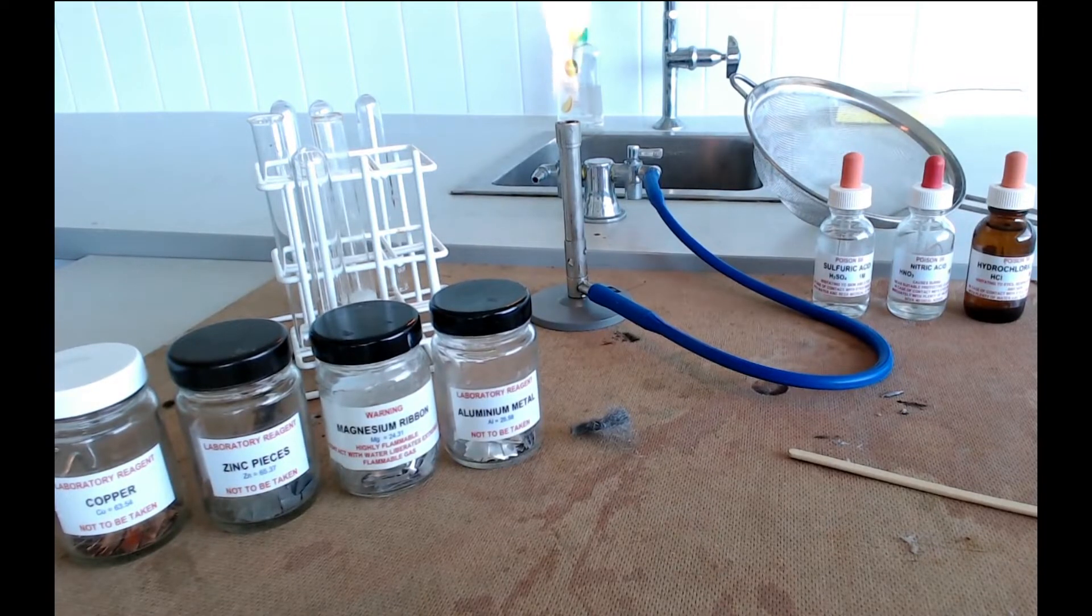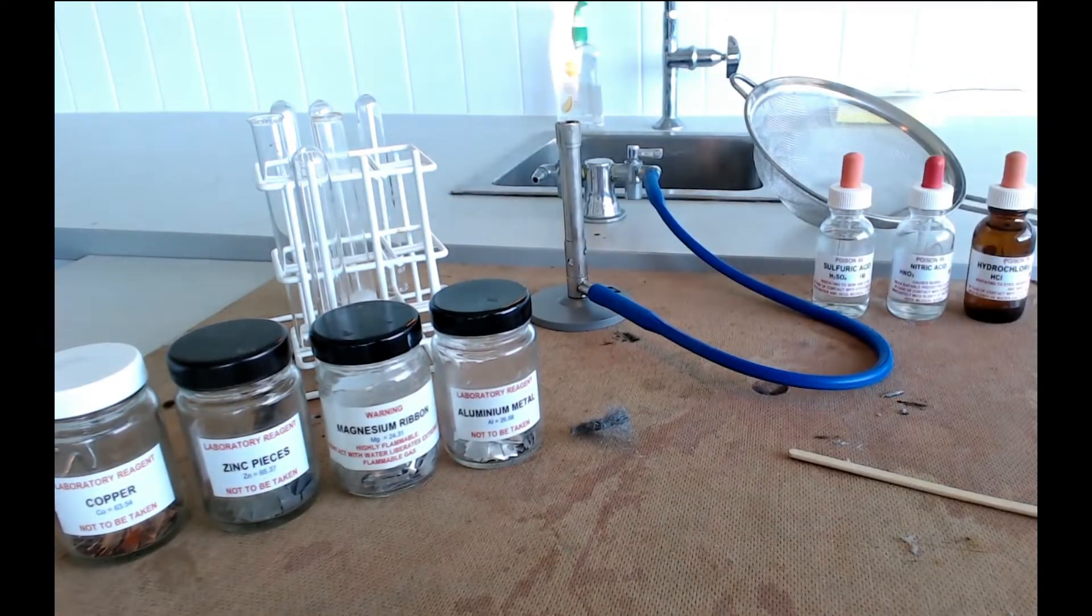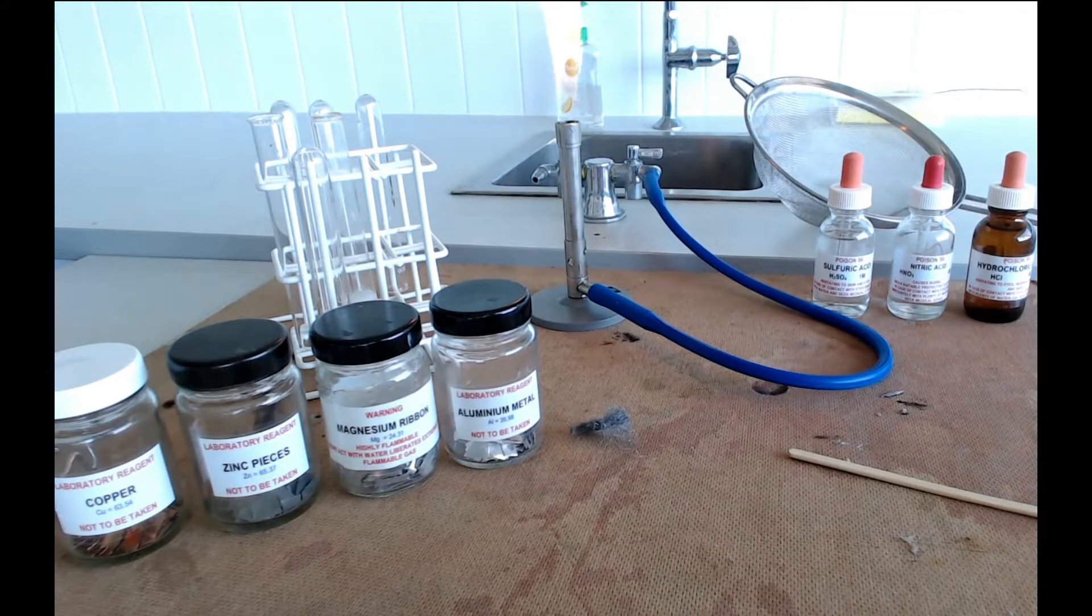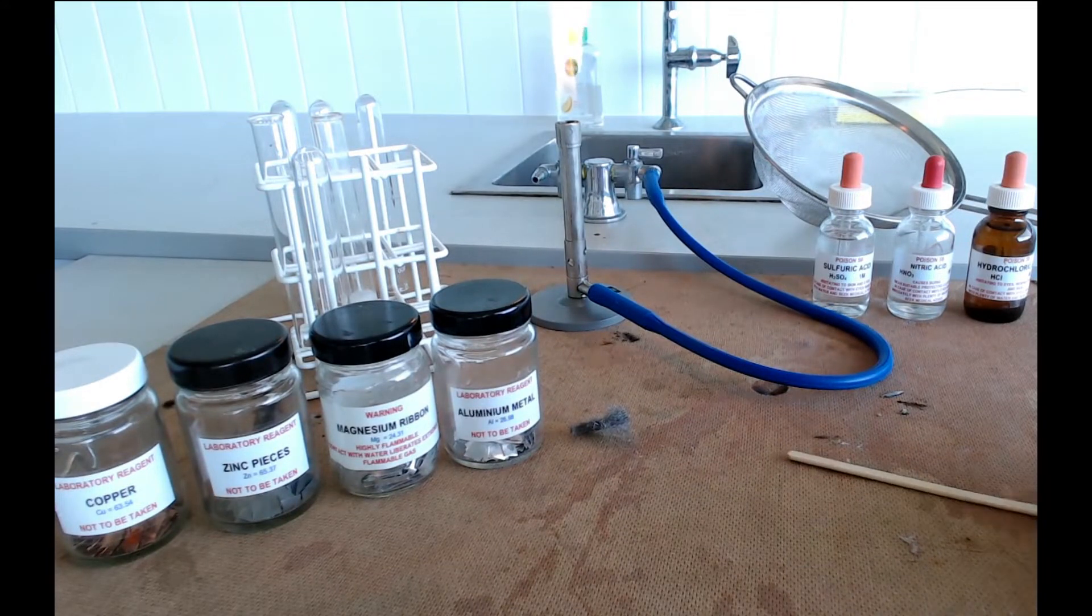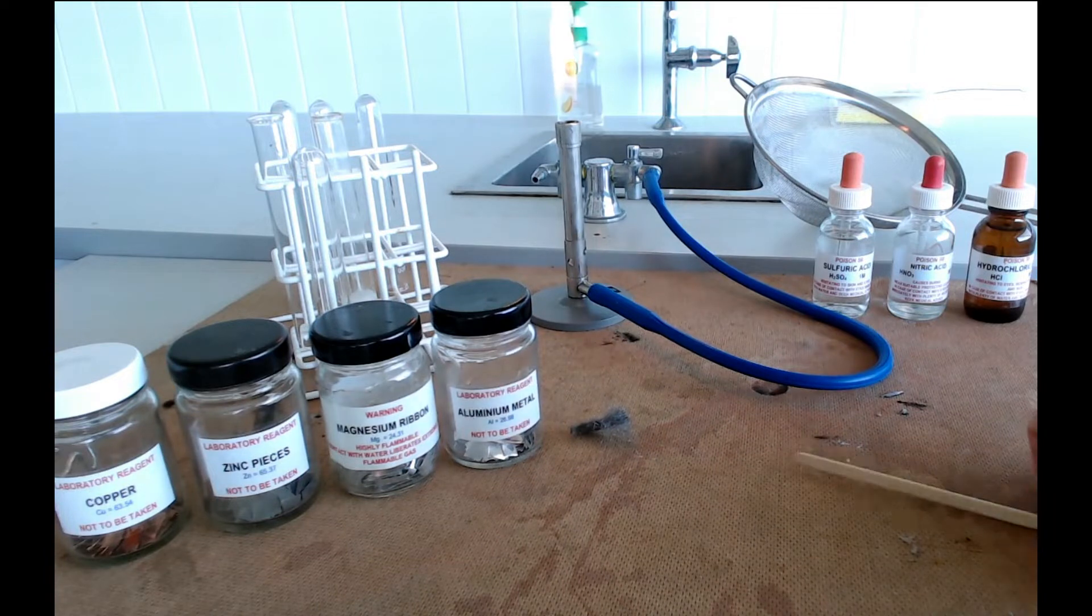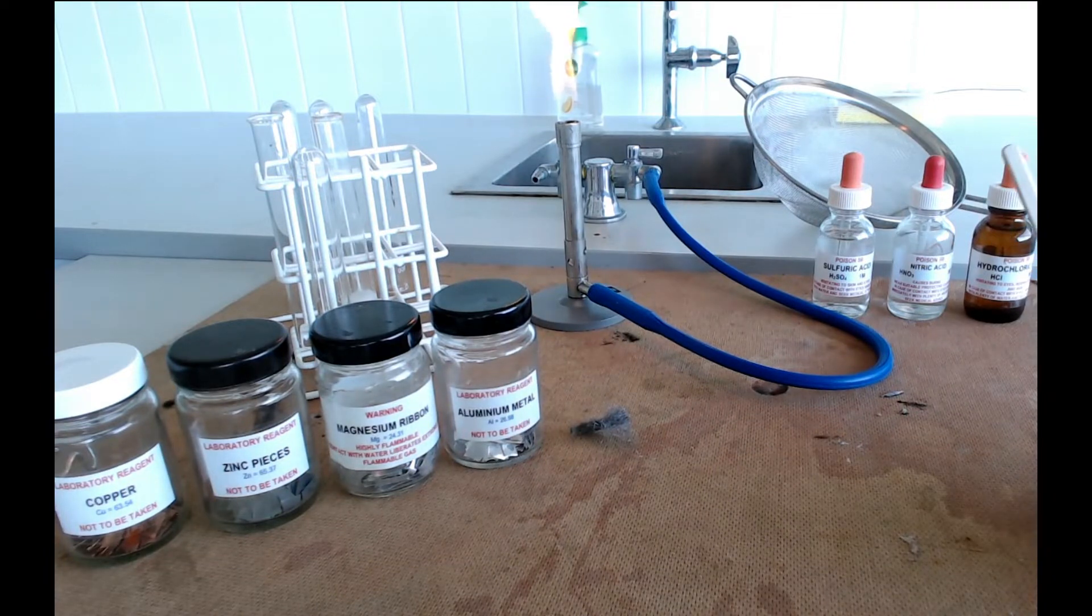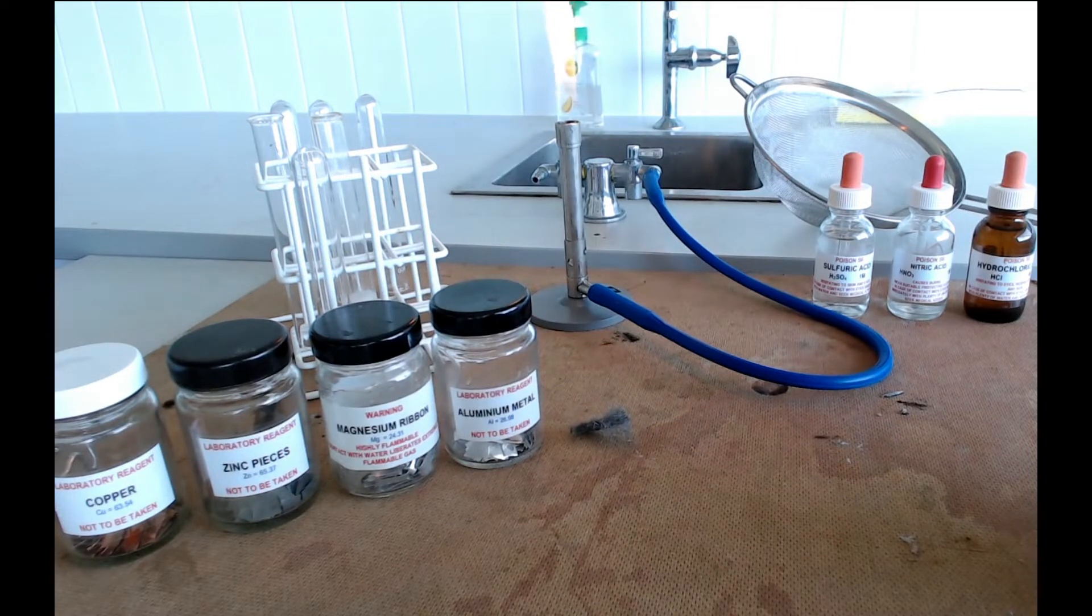Now every one of these reactions is going to take place inside a test tube. So you need some test tubes. And you're also going to produce a gas on some occasions. So you want to test that gas today by seeing what effect a flame has on that gas. So we've got this wooden splint which we're going to use to try and light any gas that we produce.